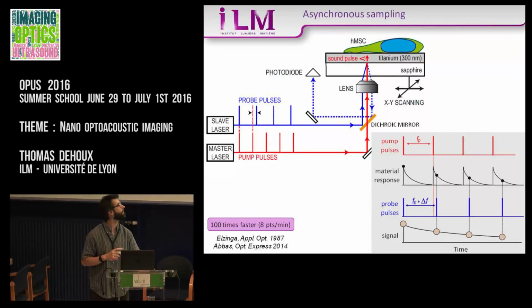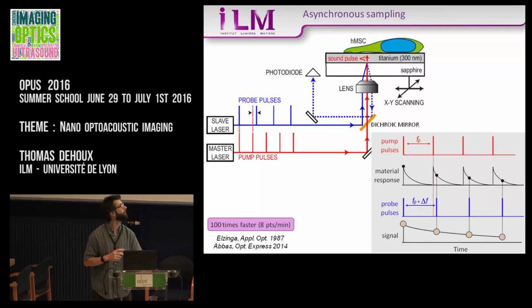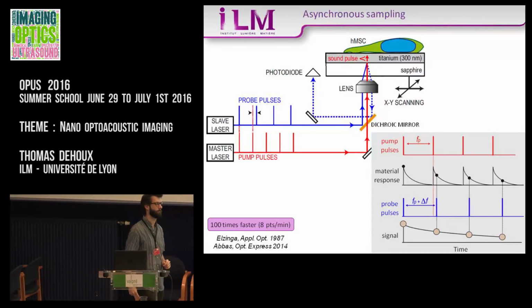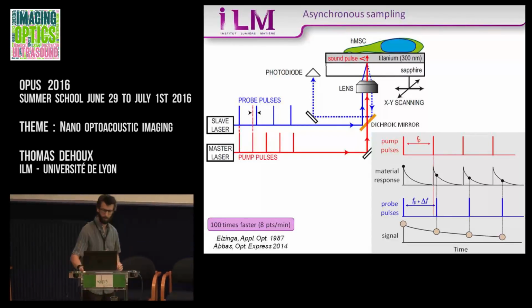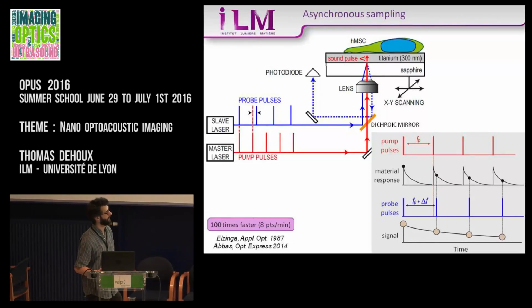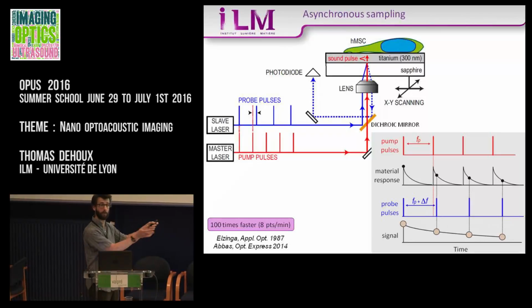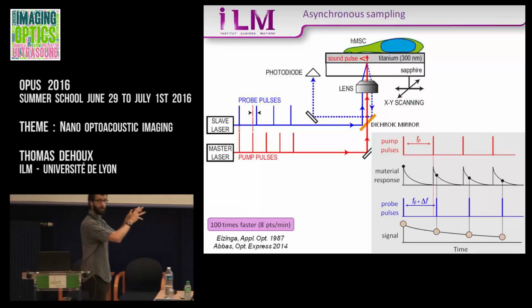What kind of electronics do you have to get a resolution of 1 picosecond? How do you process this, in terms of electronics, to get a time of 1 picosecond? When you do this, the pump pulse produces the response of the sample, which is very fast, on this picosecond time scale.